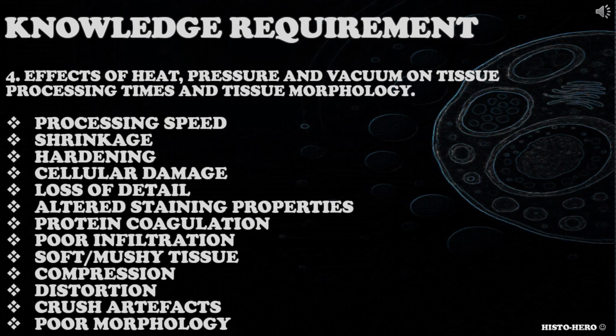The fourth knowledge requirement is effects of heat, pressure and vacuum on tissue processing times and tissue morphology. Candidate needs to have the knowledge and understanding about the effects of heat, pressure and vacuum on processing times and tissue morphology.